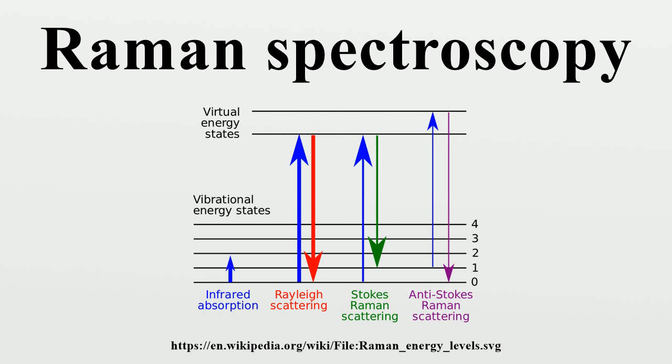using a confocal Raman microspectrometer with the 632.8 nanometers line from a helium-neon laser with a pinhole of 100 micrometers diameter. Since the objective lenses of microscopes focus the laser beam to several micrometers in diameter, the resulting photon flux is much higher than achieved in conventional Raman setups. This has the added benefit of enhanced fluorescence quenching. However, the high photon flux can also cause sample degradation, and for this reason some setups require a thermally conducting substrate in order to mitigate this process.